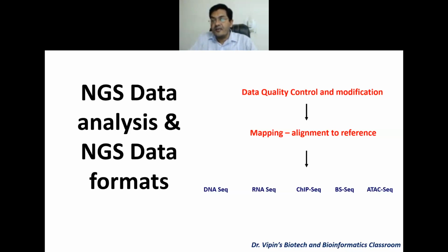So a program recognizes a specific format. So the data has to be in a specific format for it to be processed further. Otherwise, you'll have problems in your analysis. So therefore, we'll talk a bit about data formats before moving on to Galaxy. So here you have NGS data analysis and NGS data formats. So first, let's talk of the data format.